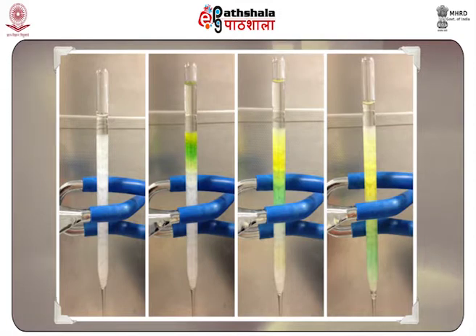Gravitational pull is the only force that works on a simple laboratory column, but in modern versions, a much faster flow rate is achieved by employing compressed gases like argon, nitrogen, etc., or by making use of a pump to push the mobile phase through the column.